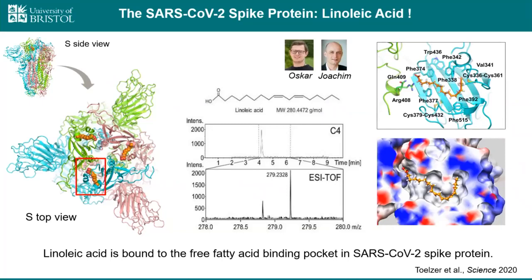virions in these cells. What struck me most at the beginning were these big dark blobs, and some of them were really huge, so I was a bit frightened. But then when we did the same experiments with non-infected cells, they also showed these dark blobs. Then I found in old histology books images of adipocytes. So these are lipid droplets. We treated the cells with linoleic acid, and clearly they take up the linoleic acid, and here we find lipid droplets in the cytosol. So it's a nice internal control that linoleic acid really is in the cytosol.